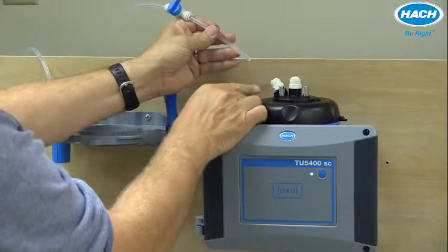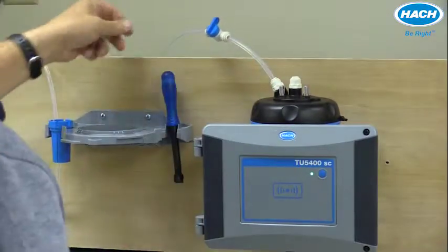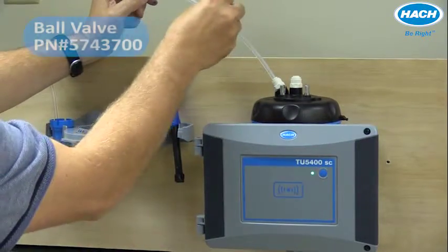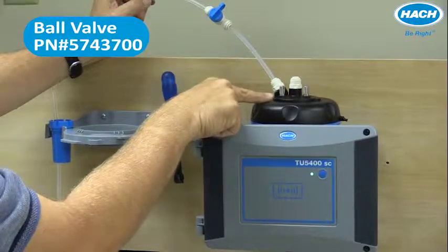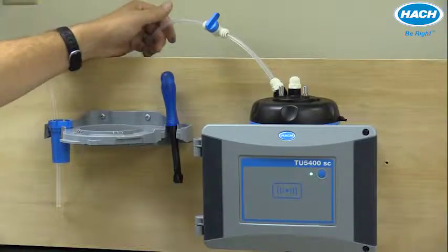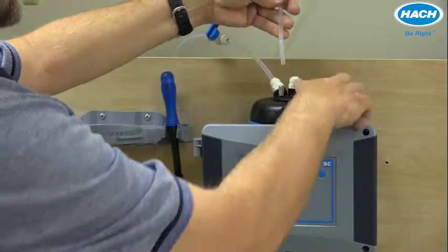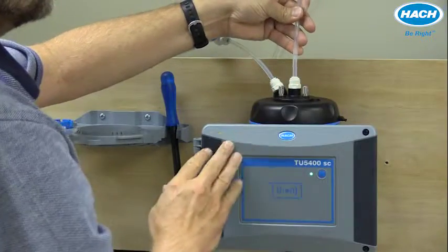To connect the tubing to the sensor, simply press it in until it's seated. Notice on the inlet tubing I have installed a shutoff valve to allow me to discontinue the influent flow for the purposes of maintenance, calibration, and the like. I've also routed a drain line that will connect to the outlet point of the TU-5400.